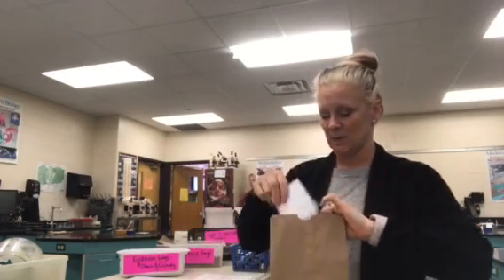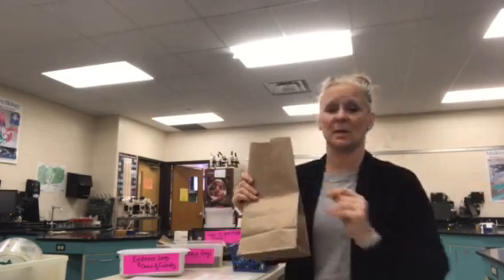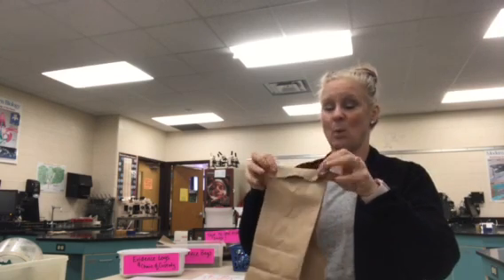So I've got my bindle. Well, now what do I do with it? So now I want to take it and I put it inside of my evidence bag. So again, I just want to make sure that it's all the way down into the bottom of the bag. And this is where things get tricky, so make sure that you're paying attention. I'm going to fold my bag, not once, okay? Heavy duty lunch sack here. You've got to fold it two times.